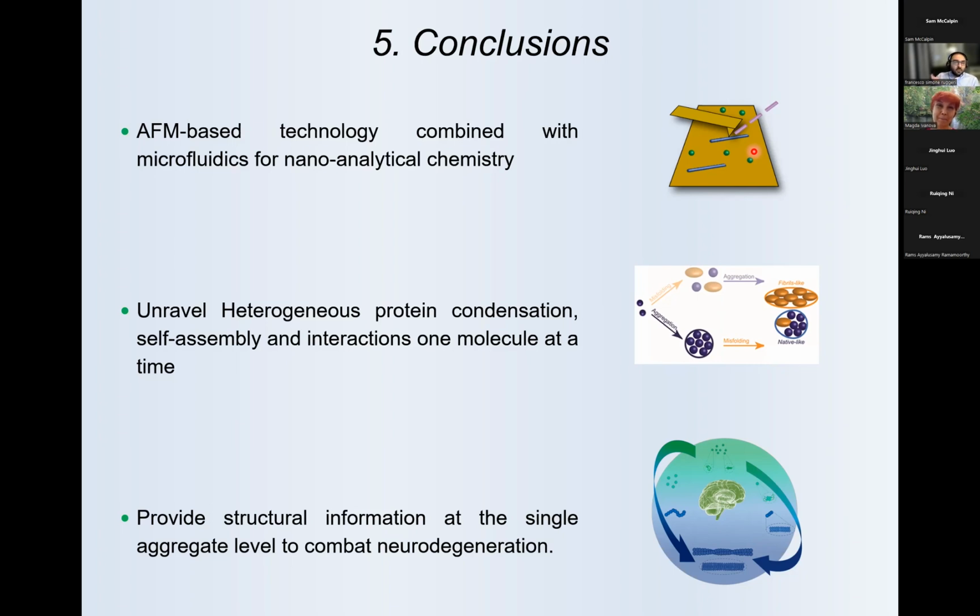Sure. First of all, looking at the maps, we have the power of heterogeneity, so we can measure the Young's modulus of a single fibril. We don't need to measure on a bundle. We can exclude those. This is the power of mapping at the nanoscale. So we just get the information from the single fibers and we compare. So we can do single aggregate Young's modulus measurement.